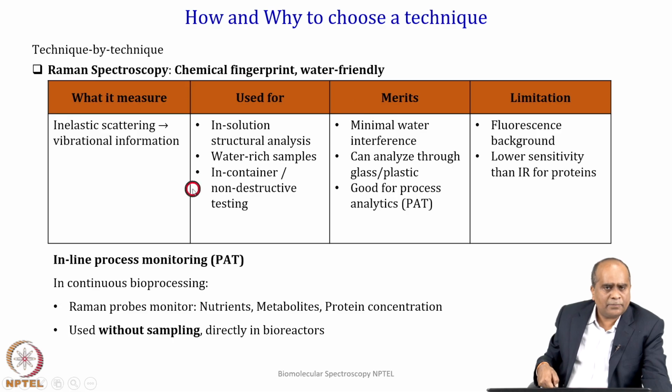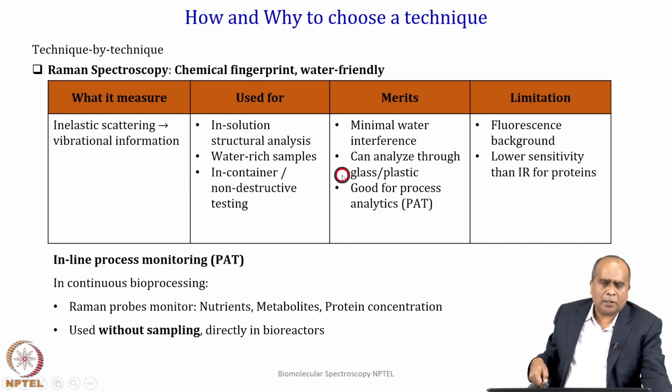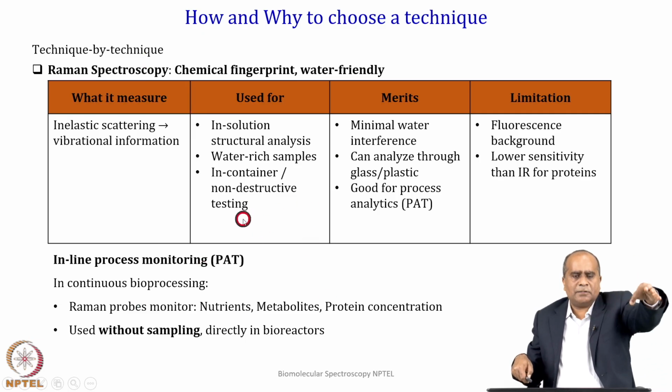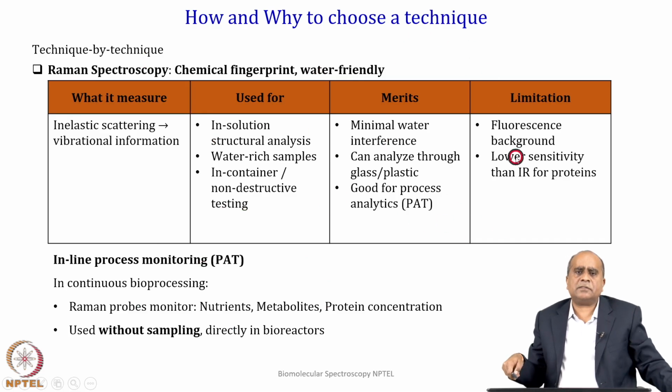It can be used in solution, water-rich samples, no problem, with Fourier transform Raman spectroscopy. It is a non-destructive technique: in a capillary you just put the sample, shine the laser, do the experiment, and recover your sample.